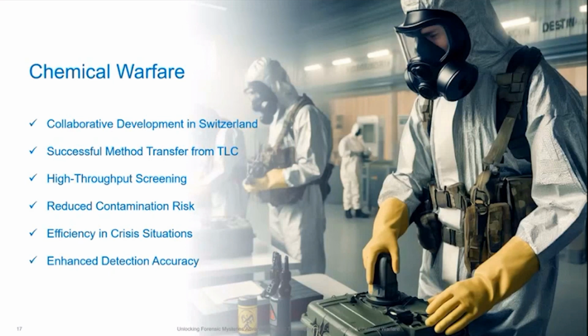The chemical warfare method was developed in the last 2 years through a contact with a specialized army lab in Switzerland dedicated to detecting chemical warfare agents. It is a very sensitive topic, and of course, CAMAG doesn't have any standard in this direction, but this specialized lab offered us all the facility to develop this method. Again, it was a transfer from a TLC method used in the OPCW.